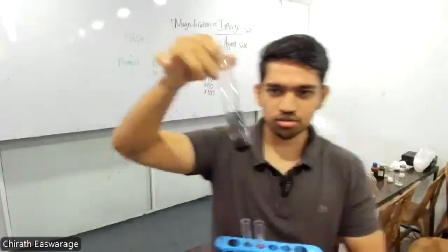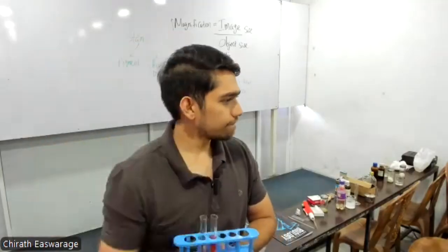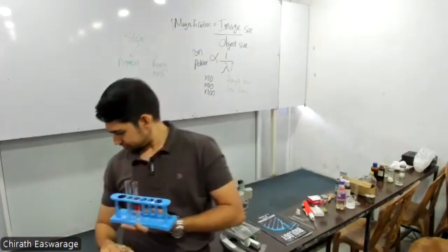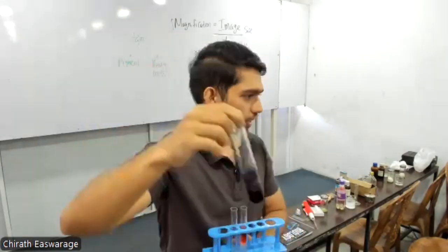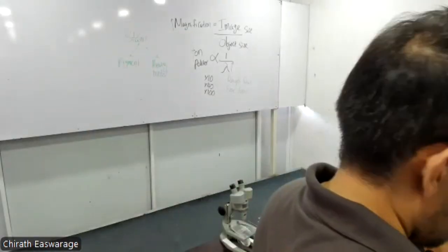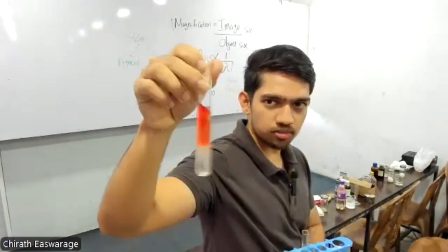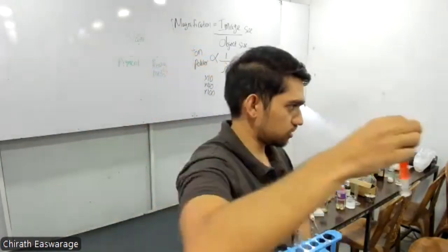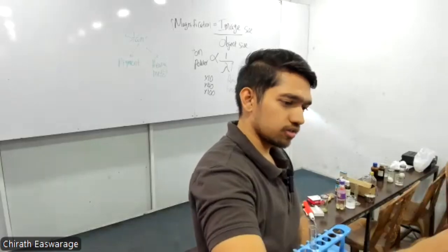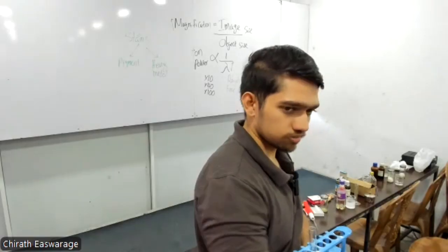We observed starch. Right? Iodine test for starch. Originally brown colored iodine turns black or dark blue with starch. Right? Then we did Sudan 3. Can you see the layers nicely separated? Water layer and the coconut oil layer, which is a lipid, stained with the non-polar dye, Sudan 3.